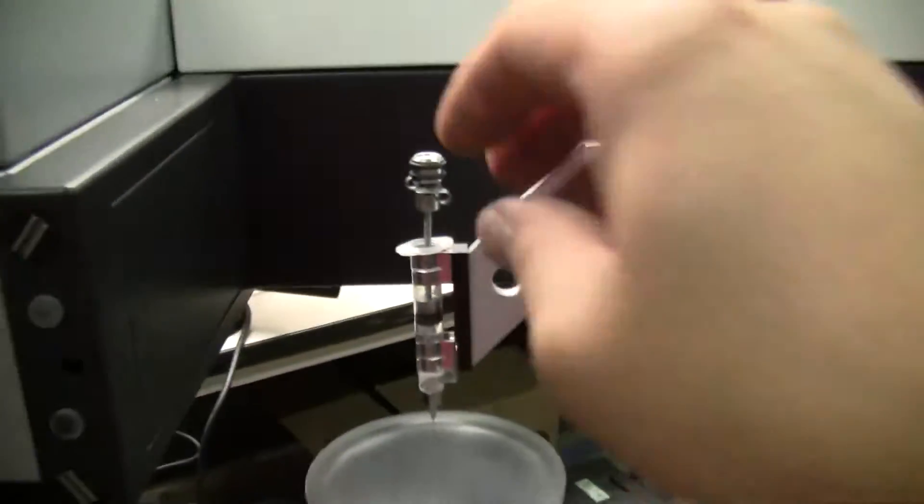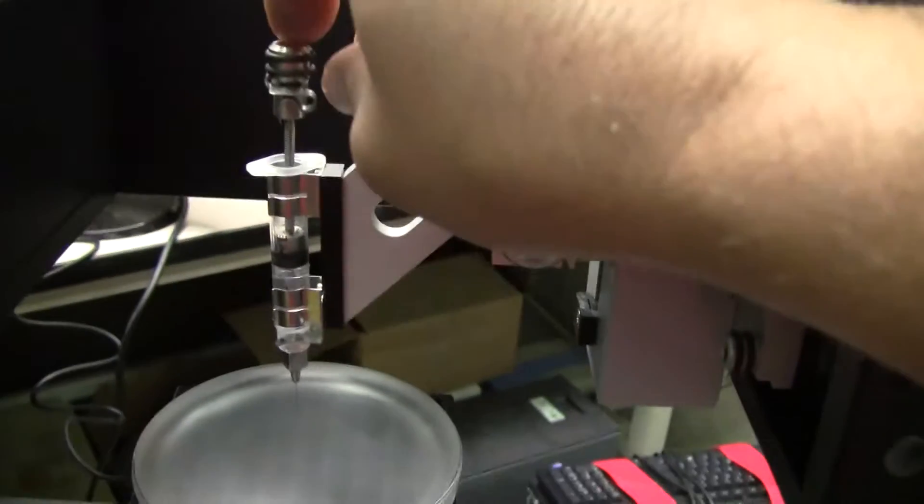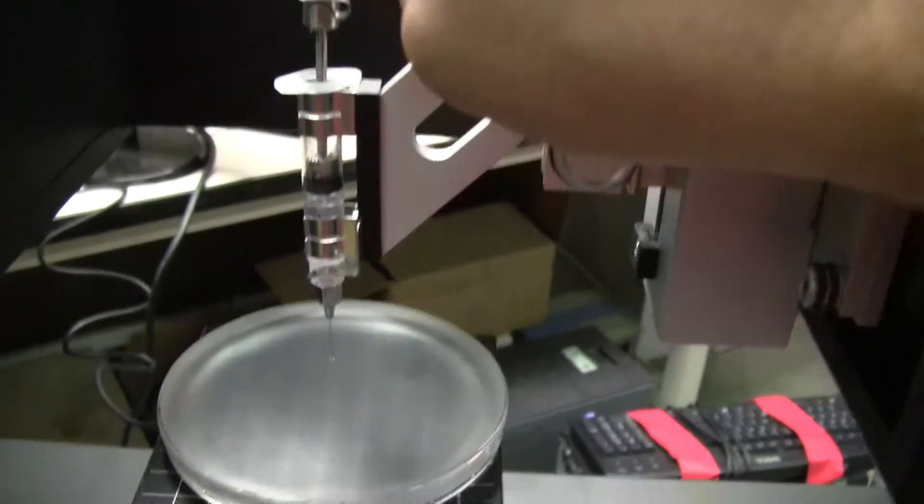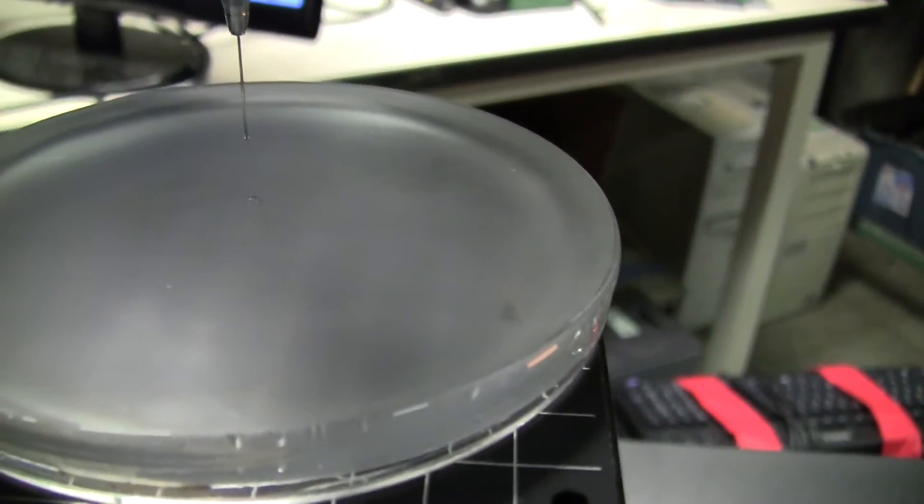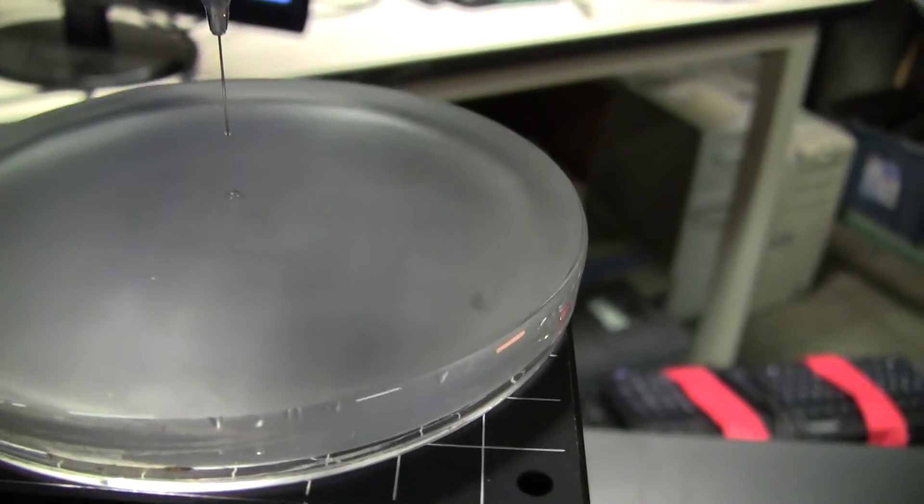So I'm going to put a drop on it. A drop has been placed. Look at that, it's fantastic.